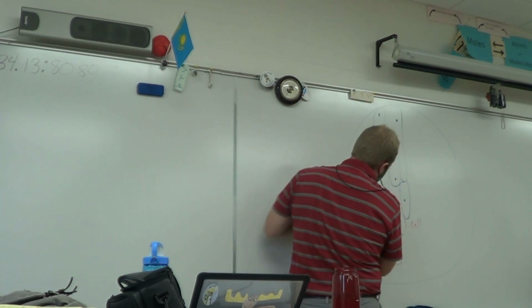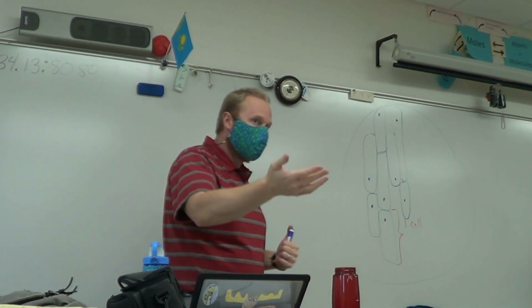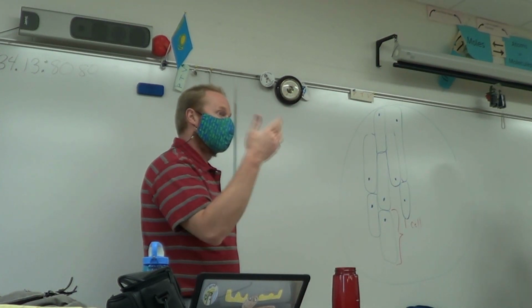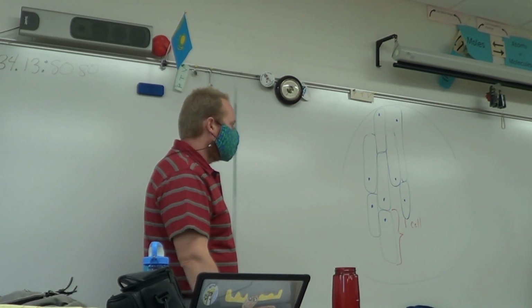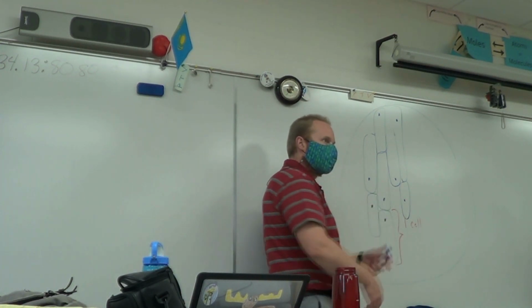Well, then you're going to say, about how many of these things can I fit across? However many that is, it could be 0.2, it could be 18, you take your field of view, divided by the number of objects you think you can fit across, and that will give you your approximate size. Okay, so I think for this onion cell, we're asking for the length of the onion cell.